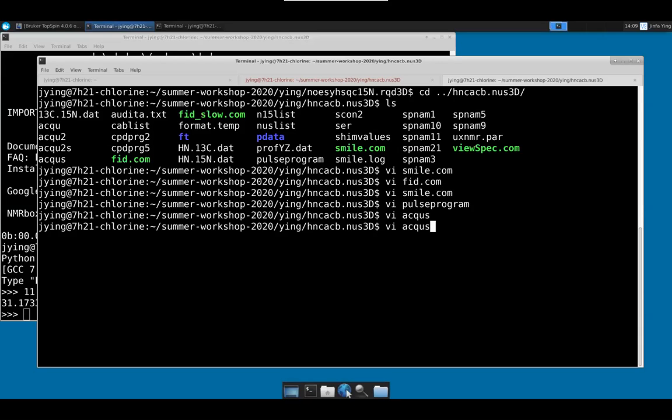It really depends. The reason we do this by default is that we assume that a lot of NUS is resolution limited. And even with NUS, you might not want to sample out too long, for saving signal to noise. And therefore, something like up to 1 T2. And if you collect it to 1 T2, by extending this you could still get a little bit higher resolution from it. Okay? It's debatable, but that's how it was programmed.